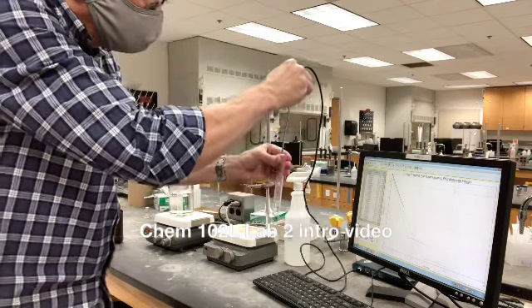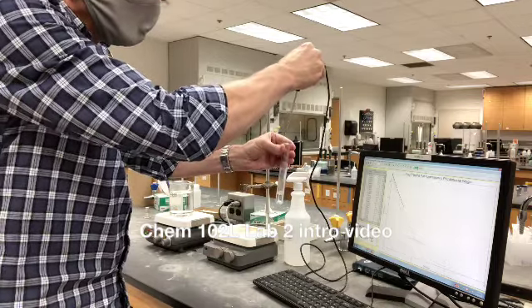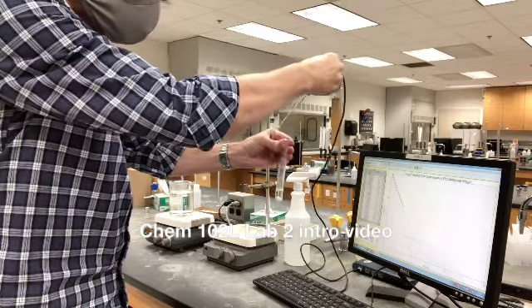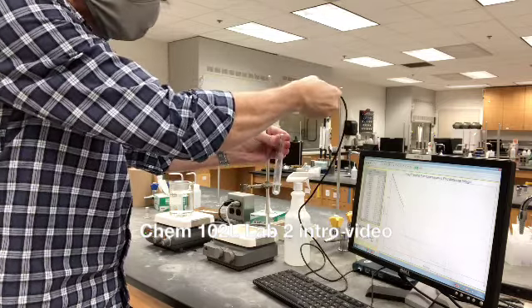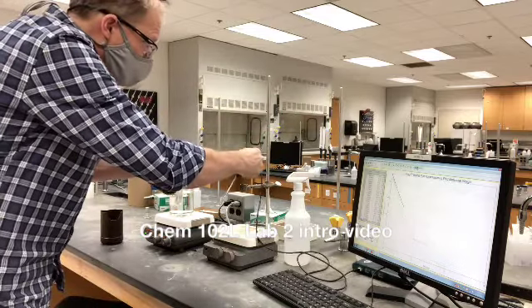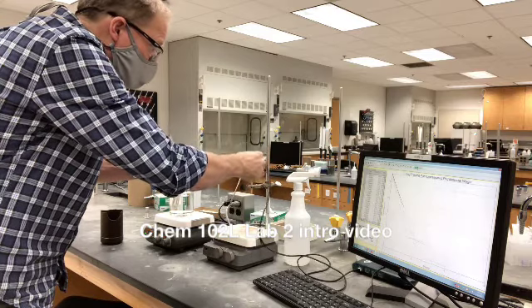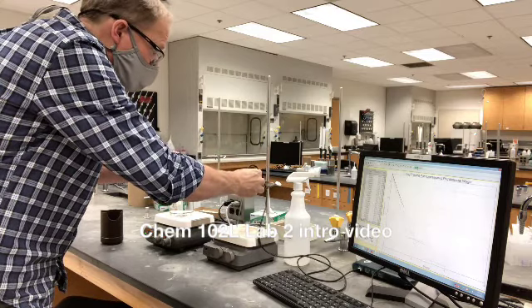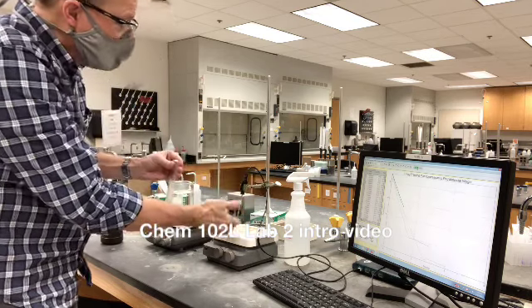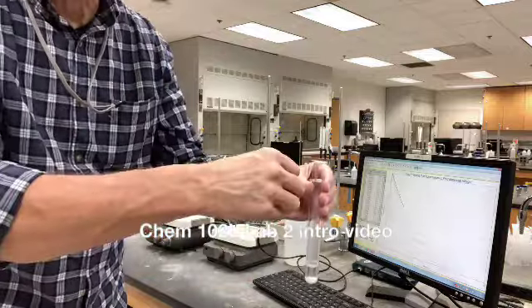So I'm going to loosen the stopper, and I'm going to try to carefully lift the thermometer straight out. And now notice there's a little bit of lauric acid on the end of the thermometer. I don't want to lose that. I want that to stay on the thermometer, and I want to be sure that it goes back in. So I'm going to set this and not let it touch my plate. And now the little bit of lauric acid that's on that thermometer is going to go back in here.